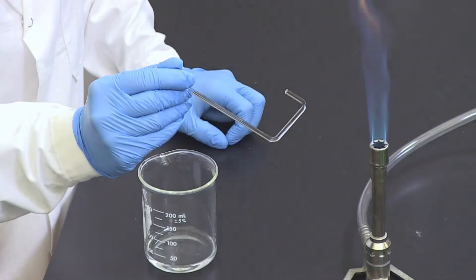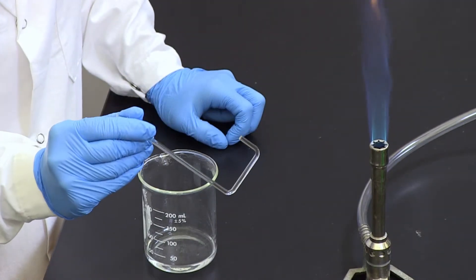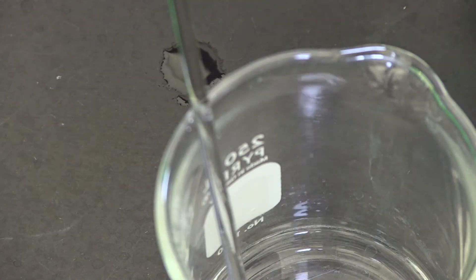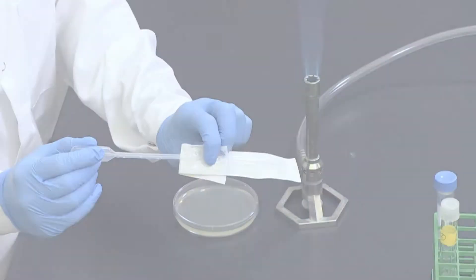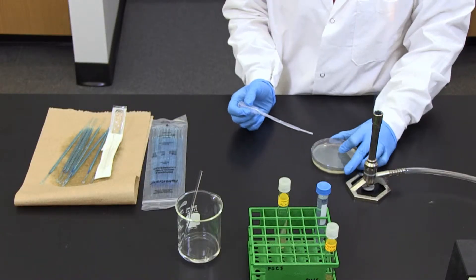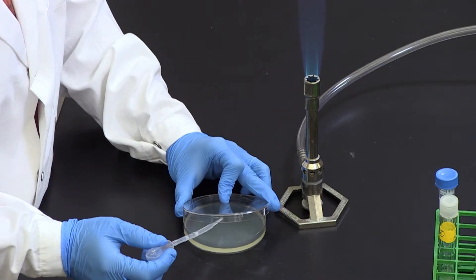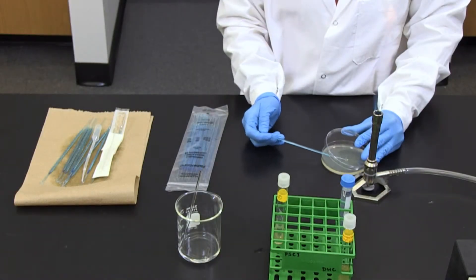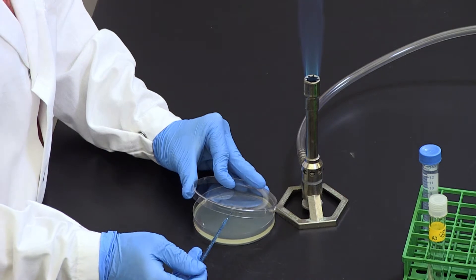To use the spread plate method: First, place the glass cell spreader in a 95% ethanol beaker. Second, with a sterile transfer pipette, place one drop of sterile water on the center of an agar plate, followed by a sterile inoculating loop full of microbes from a mixed culture and replace the lid.